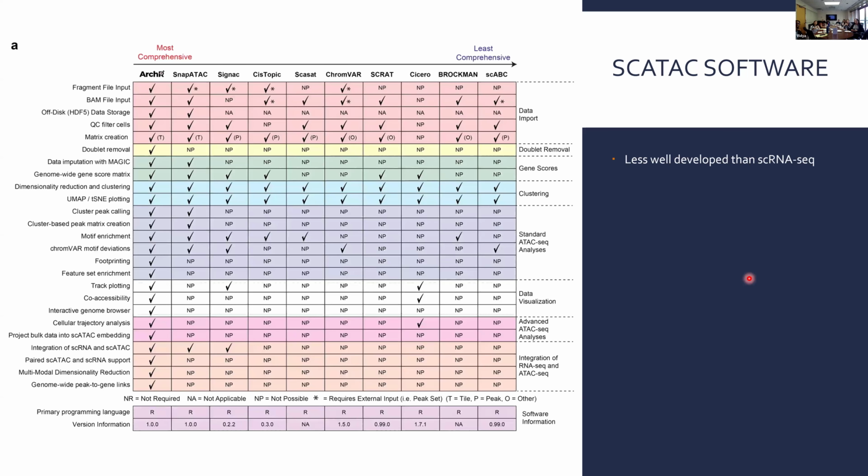Okay, so that will move us into single cell ATAC-seq, and then it'll tie back into that example in a minute. This is less well developed from the analytical side than single cell RNA-seq, and you saw that it's just not as broadly adopted as a method. My hands-on experience is predominantly using ArchR, and this is from their papers. And of course, they have all the check marks.